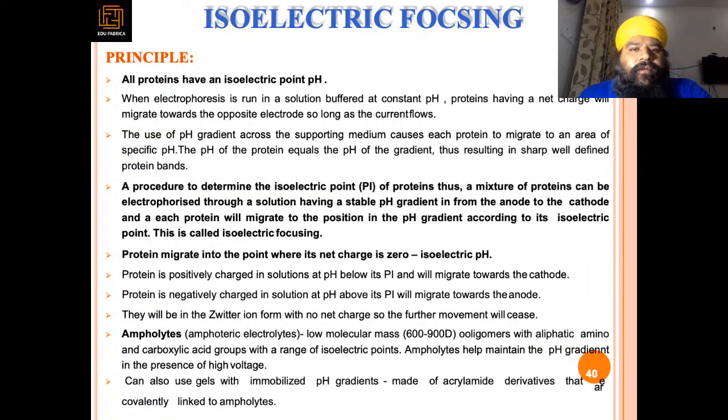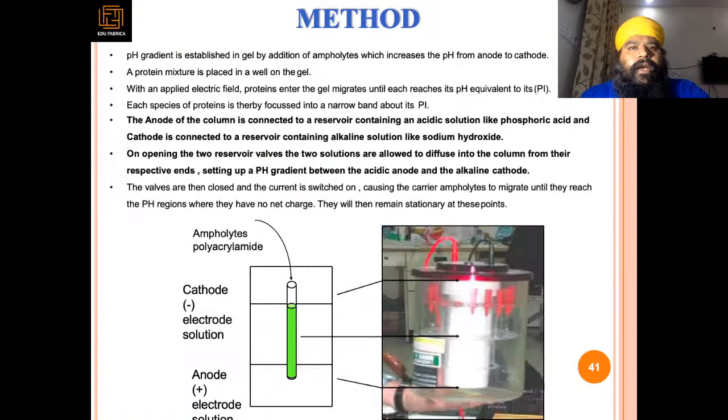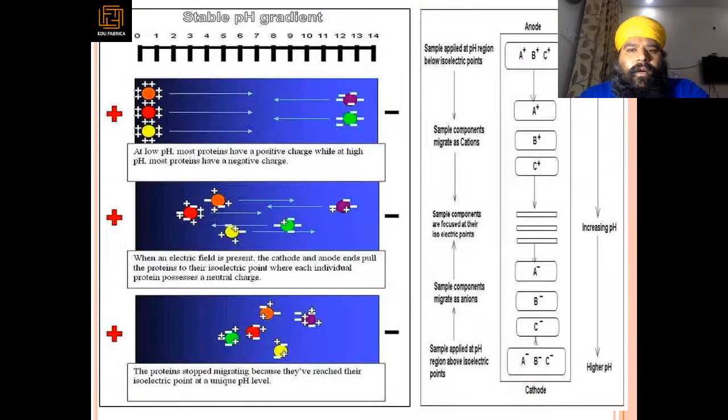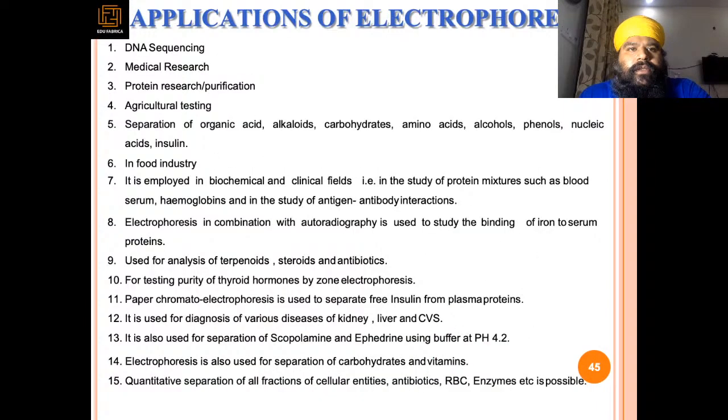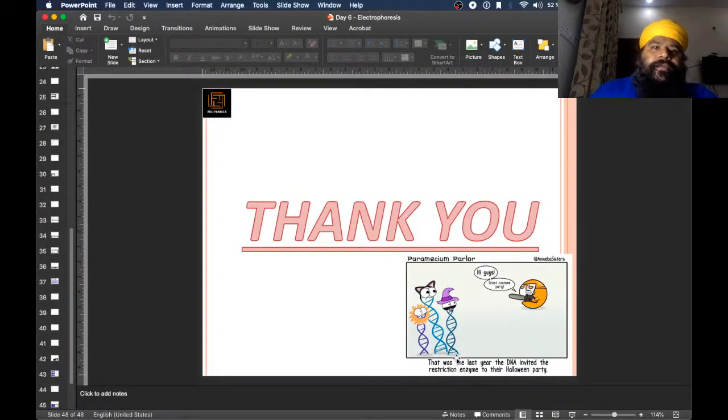And this we discussed yesterday in detail, isoelectric focusing, by that professor from BioRad, so I will not continue this part. This is already done, all the methods and how things were happening. After the isoelectric focusing, we did this two-dimensional electrophoresis. So that's it from this perspective.